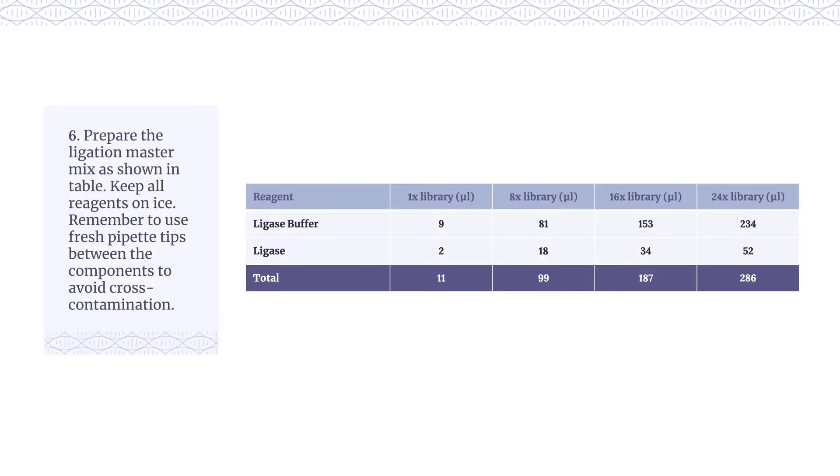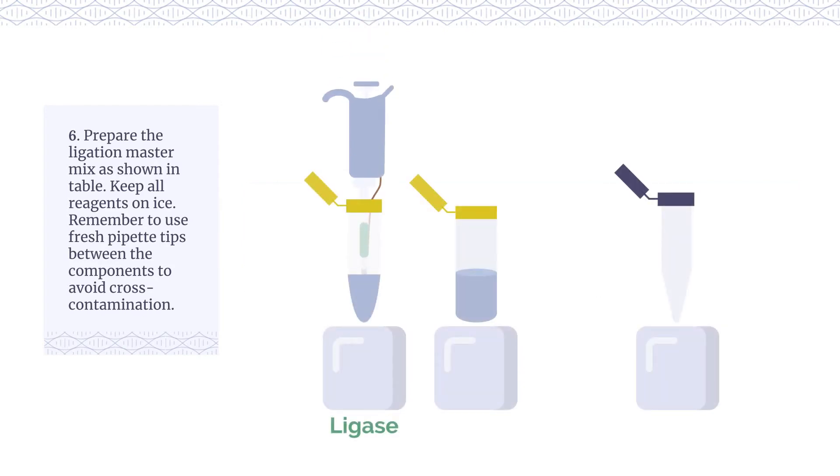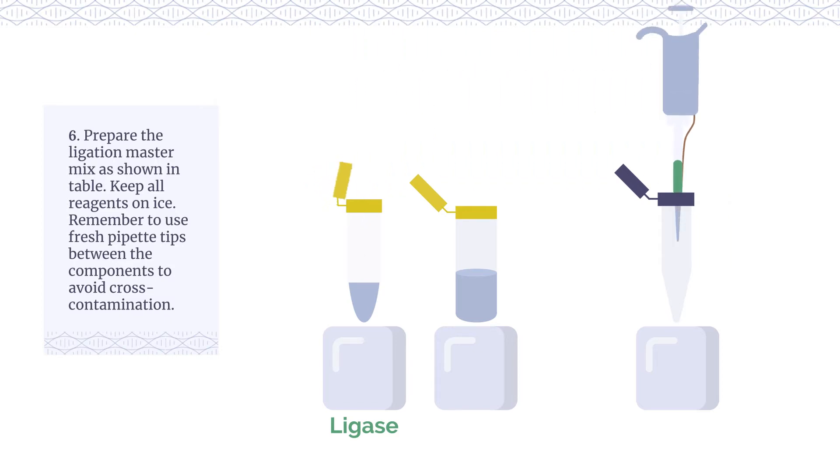Prepare the ligation master mix as shown in the table. Keep all reagents on ice. Remember to use fresh pipette tips between the components to avoid cross-contamination.